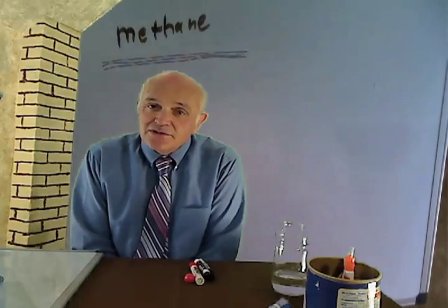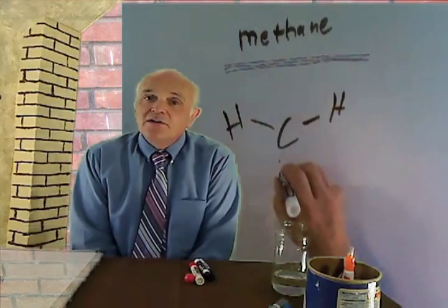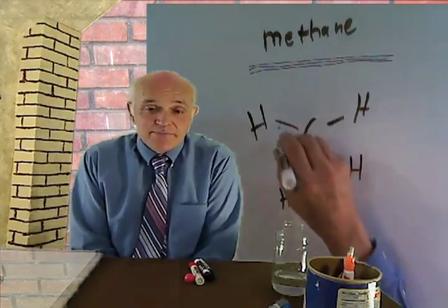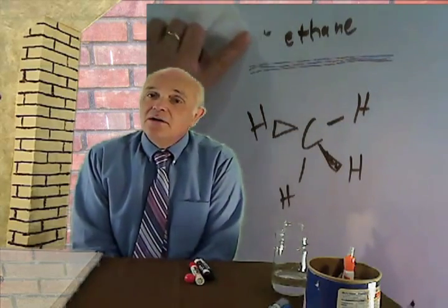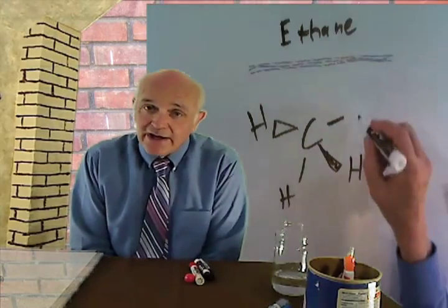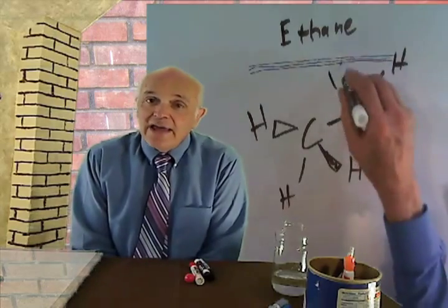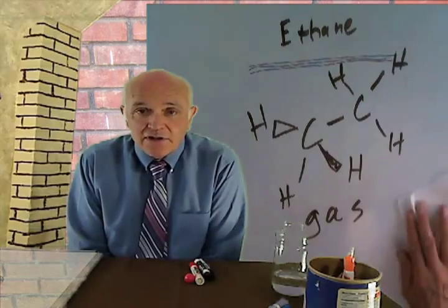8270 is the EPA mandated test for semi-volatiles. The EPA 8270 is an analysis for materials which are extractable by methylene chloride. The initial step is add methylene chloride, extract into the methylene chloride, pour the methylene chloride off, add more methylene chloride, extract, pour it off, add more methylene chloride, extract, and pour it off.